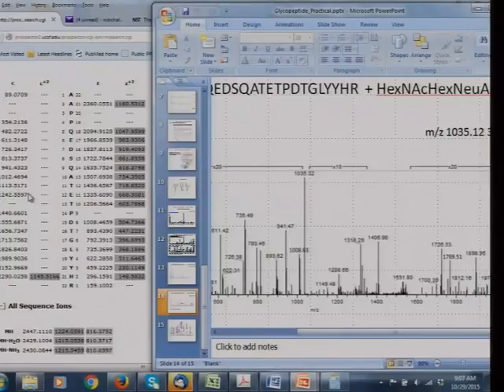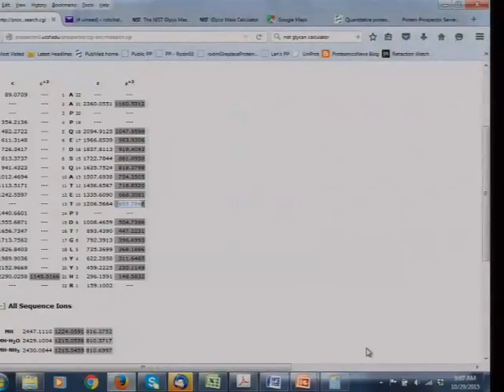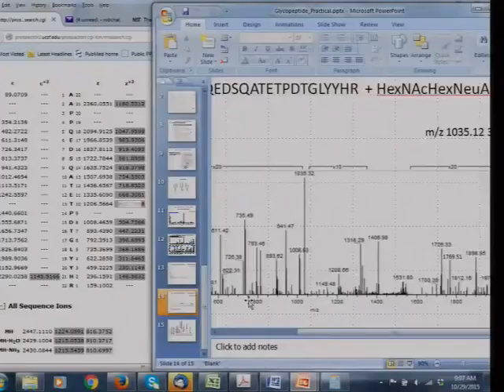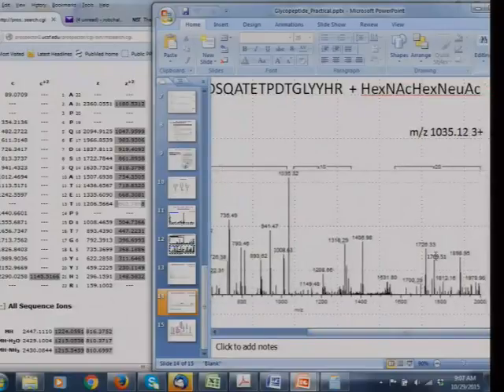So when we don't have any singly charged peaks that are going to correspond to this, it's probably going to be a doubly charged peak. So do we see a 603? Not really. 668? No. 718? No. So you don't have any ions on that end. See if we can work out what some of these peaks are. So it's going to be on one of these two threonines.